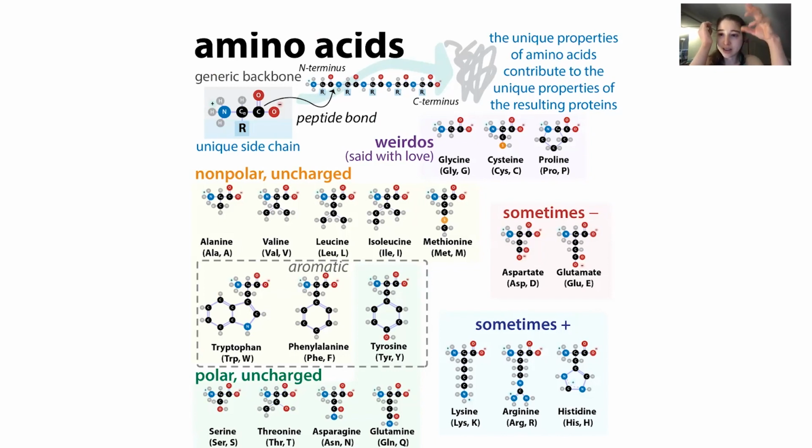If all the molecules have it in a slightly different position, then you have a higher displacement. Sometimes this is called a temperature factor, because temperature, energy, you can think of it as being dynamic.